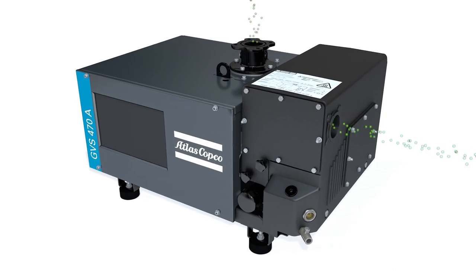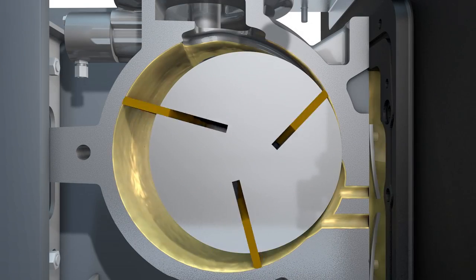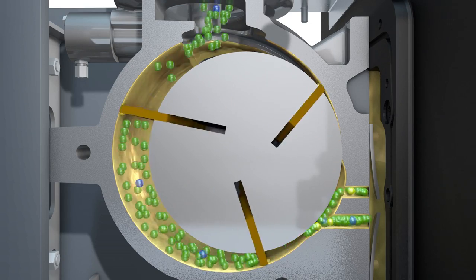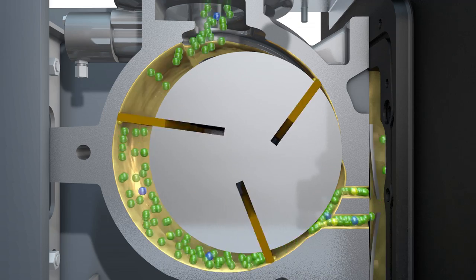As the rotor starts spinning, centrifugal force makes the vanes slide to the outside and seal against the stator housing. A volume of processed gas gets drawn in through the inlet valve as the rotor turns. This volume is then isolated from the process side and the exhaust.